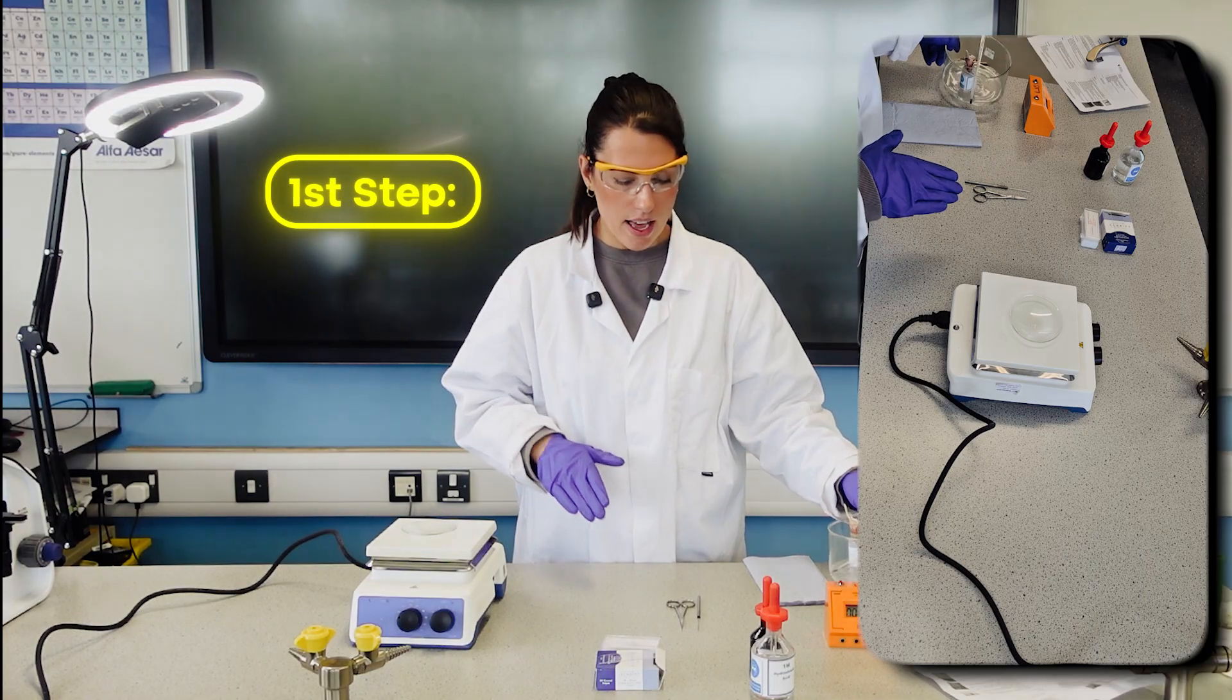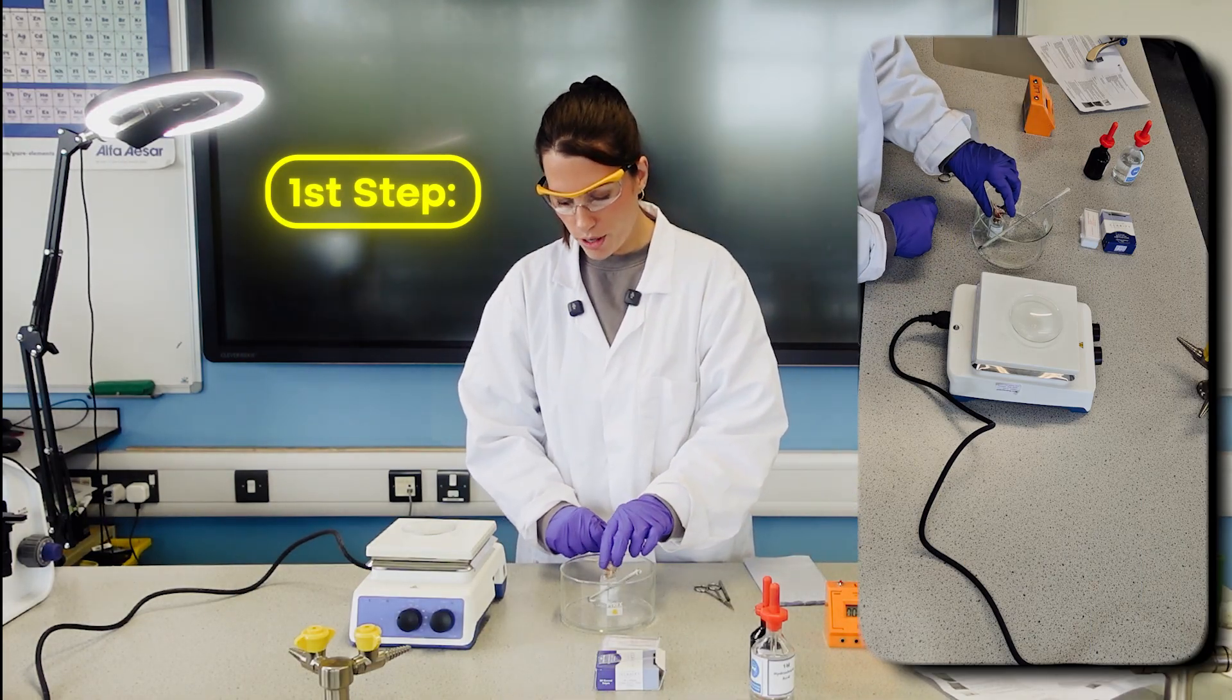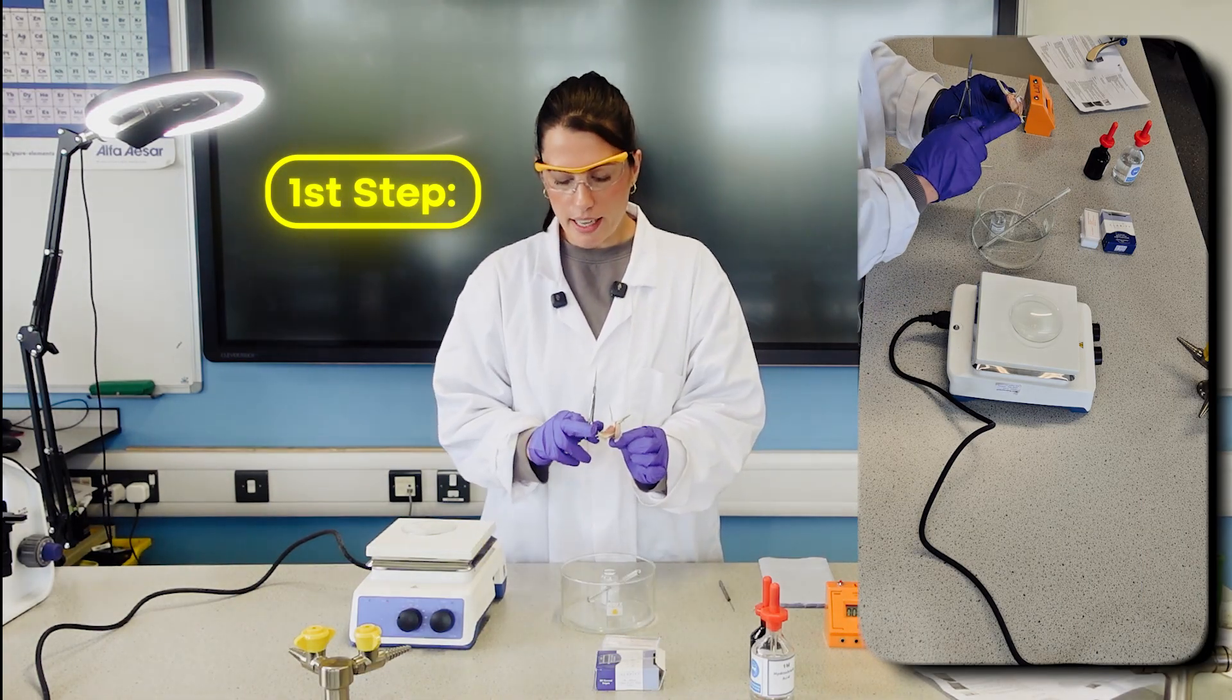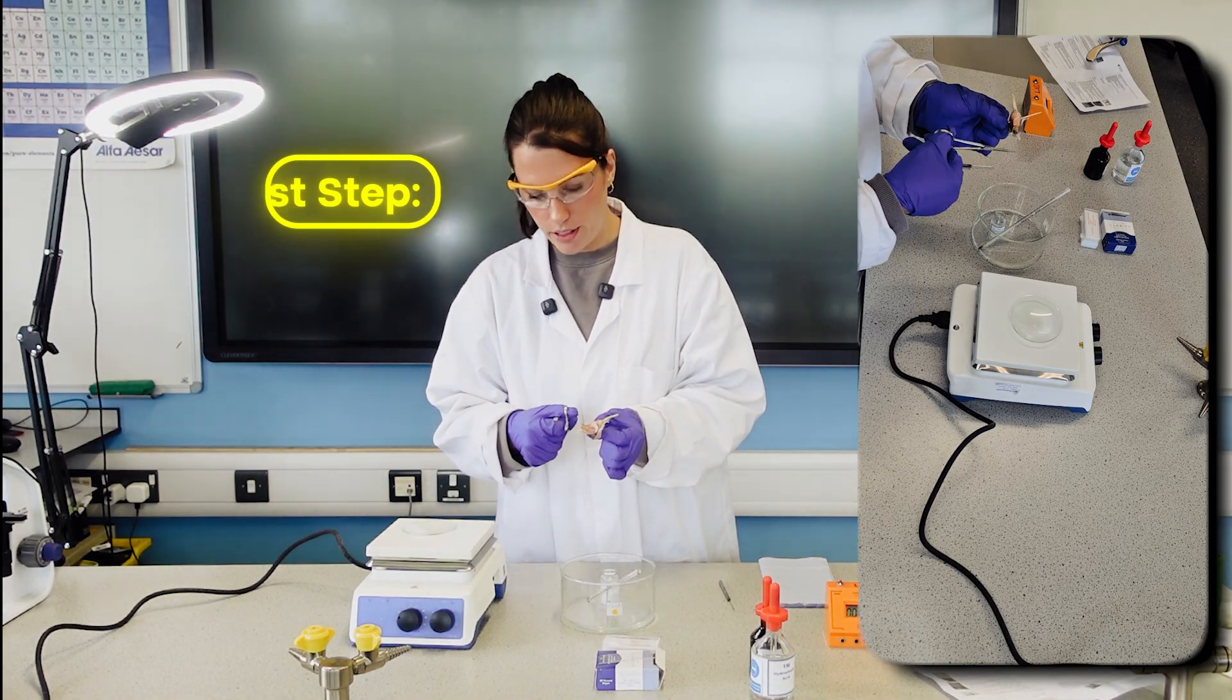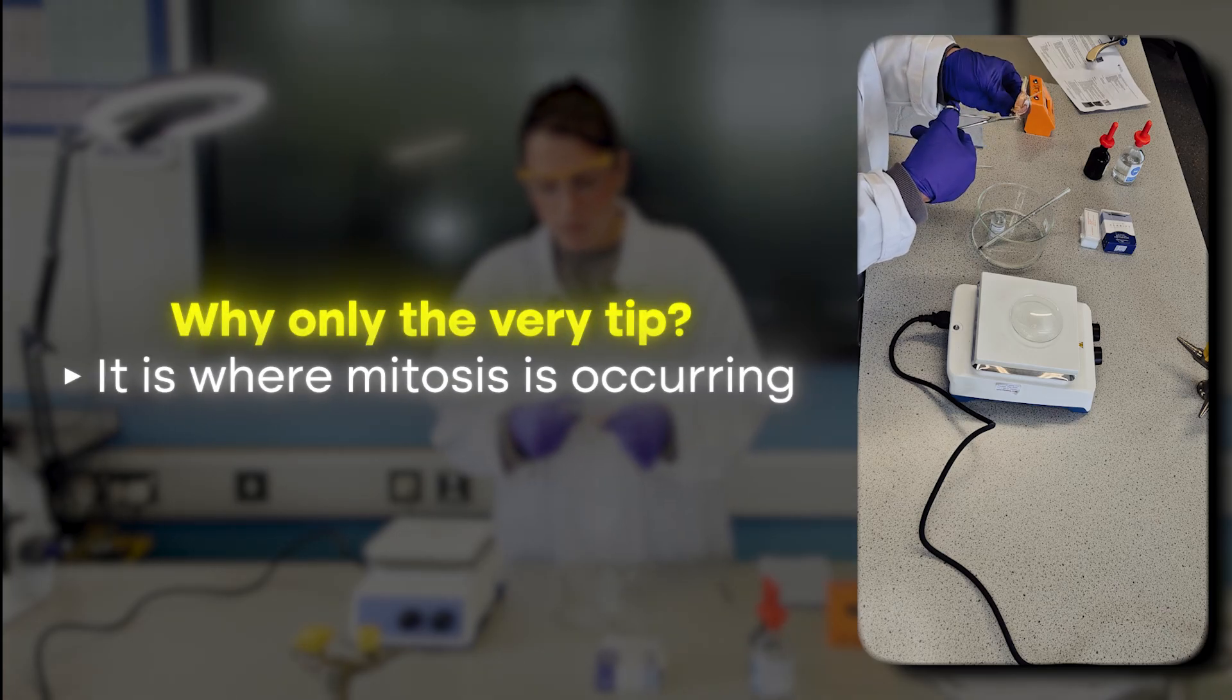The first step I've actually already done and got set up. But just to go through what you'd need to do, I've got the garlic and using my sharp scissors, I cut off just the very, very tip of that root, about three millimeters from the end.